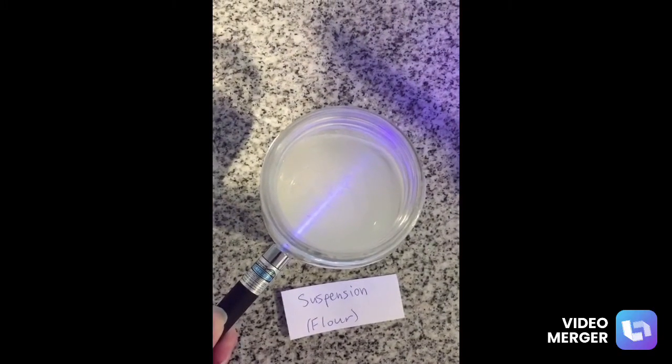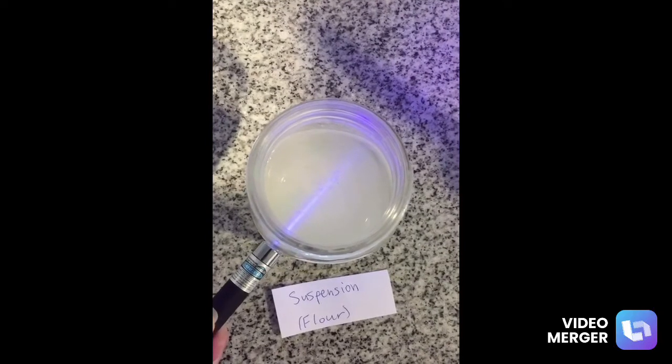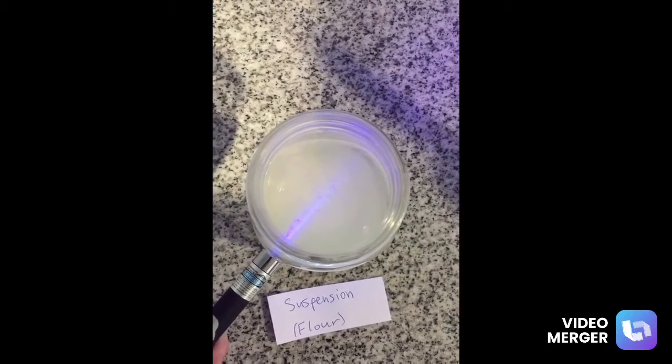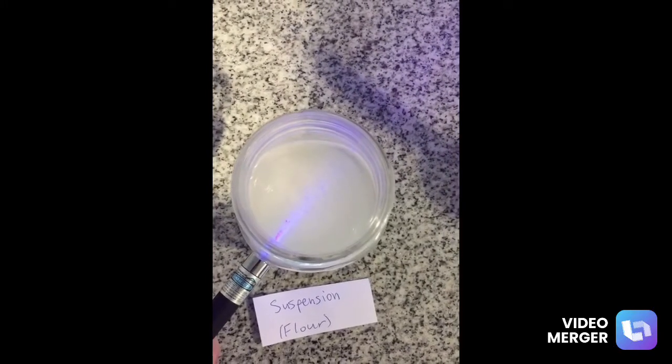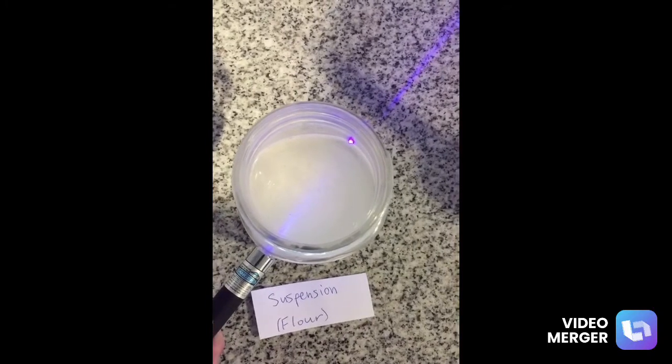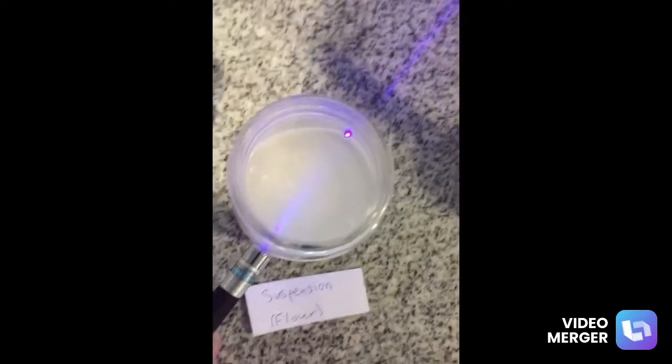We can still see the laser beam pass through the suspension mixture because its particles are large like the colloid mixture's particles were. So, the suspension particles will still be able to scatter and disperse light, which will allow the naked eye to visibly see the light pass through.